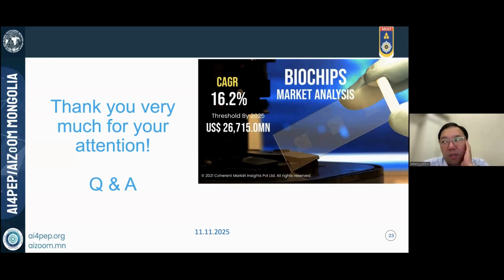It's just using the Raman spectra. It's like a fingerprint. So it's using a different way. It's not characterized genomically.